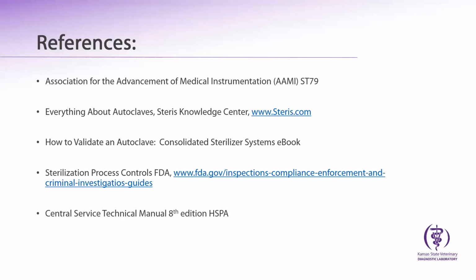You need to have a way to contain both your chemical indicator and your biological indicator. So if you don't want to use a pouch, then use a small biohazard bag, but make sure you leave 2 fingers worth of space in the top and put a piece of autoclave tape on the outside. You can use the twist ties that come with the biohazard bags. Just don't ever choke them down tight or use a zip tie, because if steam can't get in, the steam can't do a kill.